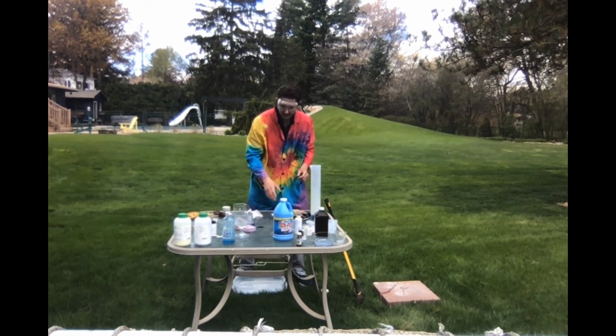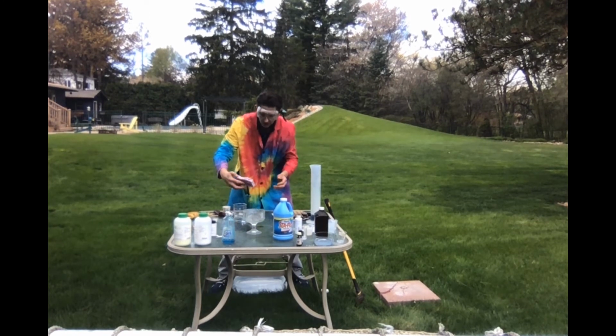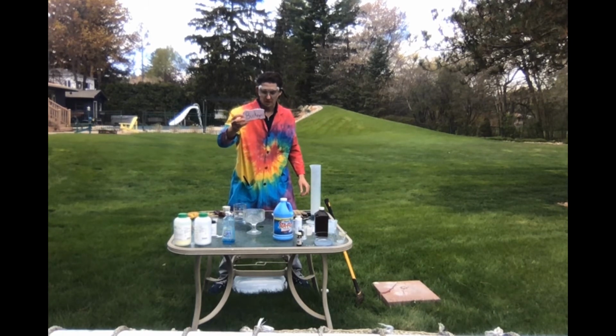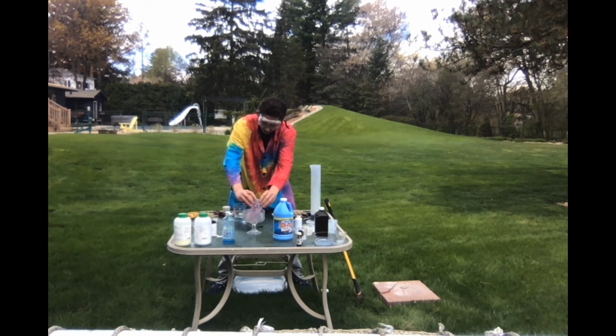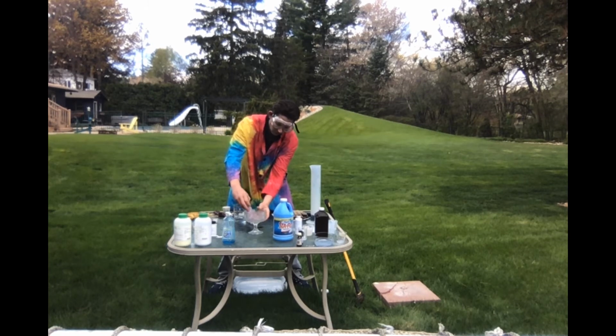All right, next is acetone and styrofoam. Acetone and styrofoam's right here. Buckeyes, you can't beat them, you got to destroy them. As the styrofoam is interacting with the acetone, the styrofoam is being eaten away.